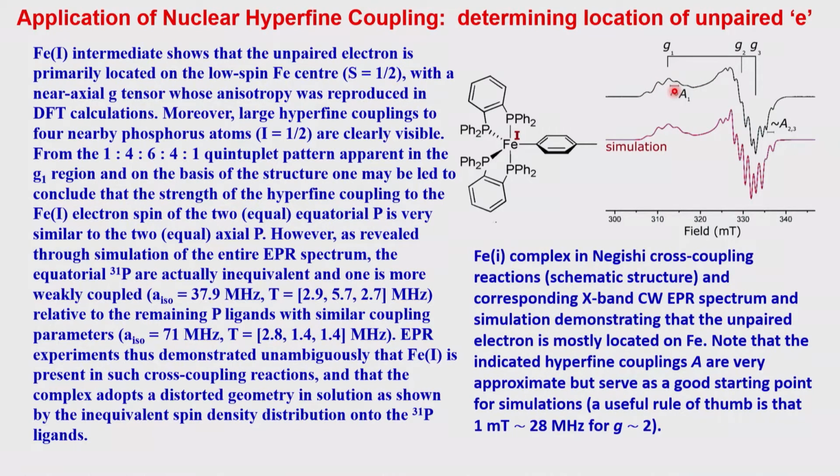So these phosphorus nuclei are coupling, and you should get similar splitting for g2 as well as g3 and then the overlay. Therefore you will not have the number of lines as expected, the 5 and 5 or 6 plus 6, 12 lines, you will not find so easily, but computationally you can model and then match them, and that is what is being done.